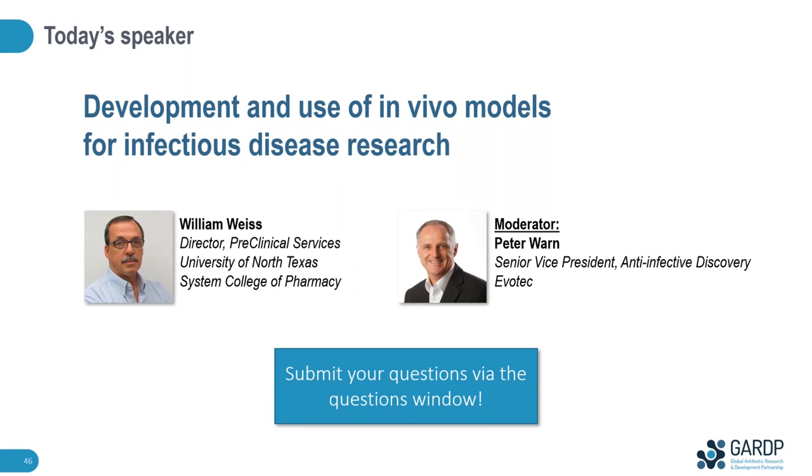Okay. So a nice, quick, easy question. Somebody's asking about preparation of inoculum. They say, can you use fresh or frozen cultures as well? So I don't know if you can comment on stored fresh cultures or frozen cultures. Well, we use fresh. All our isolates are frozen away and we will grow them up, depending on whether it's being off a plate or out of broth. We usually do 48 hours: we'll take it out of the freezer, grow it up on a plate, make sure that everything looks good, and then transfer that to either another plate if the inoculum is coming off a plate, or into broth if the inoculum is coming out of broth. But they do exist as frozen stocks.